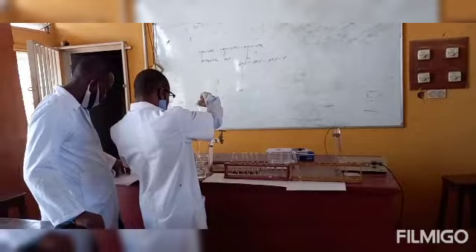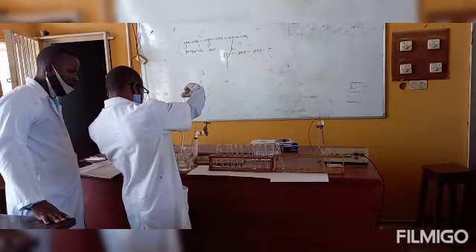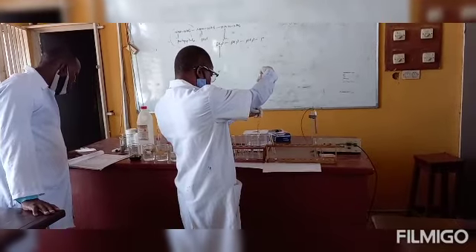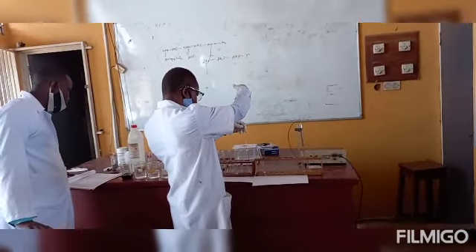From test tube 1 to test tube 11, the quantity of distilled water you add to each test tube also varies. To test tube 1, you add 4.44 ml. To test tube 2, you add 4.14 ml.